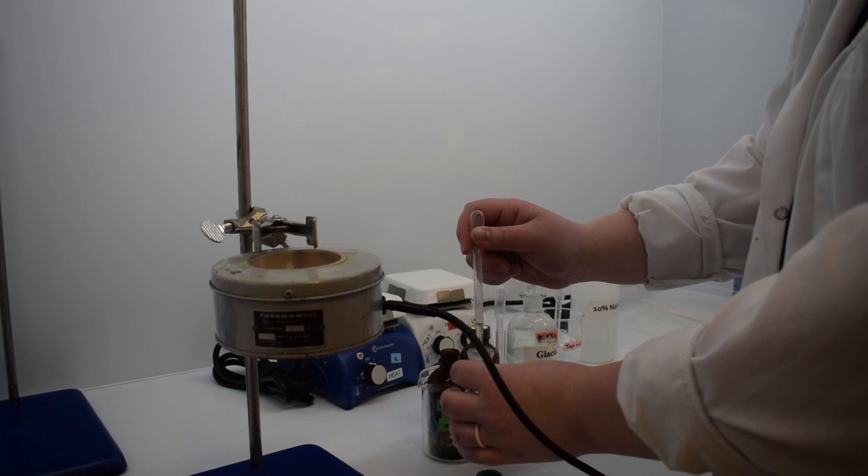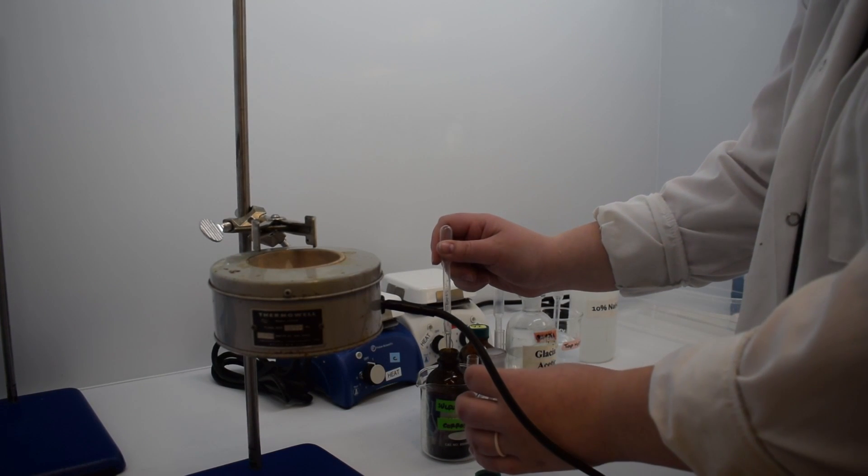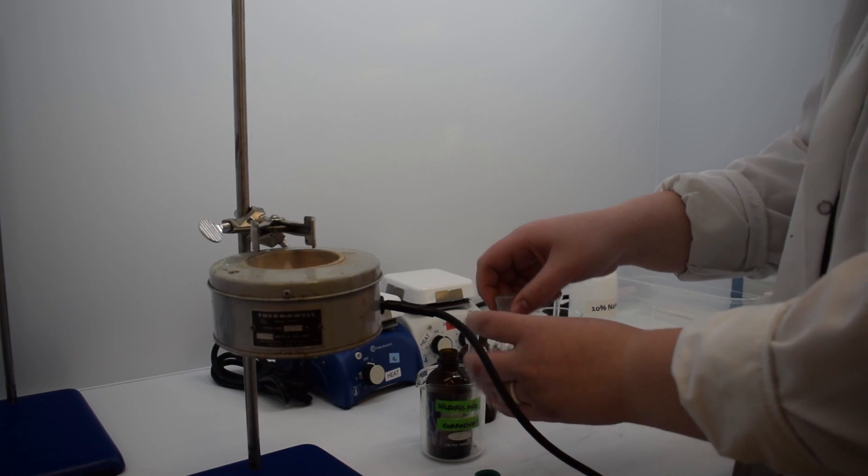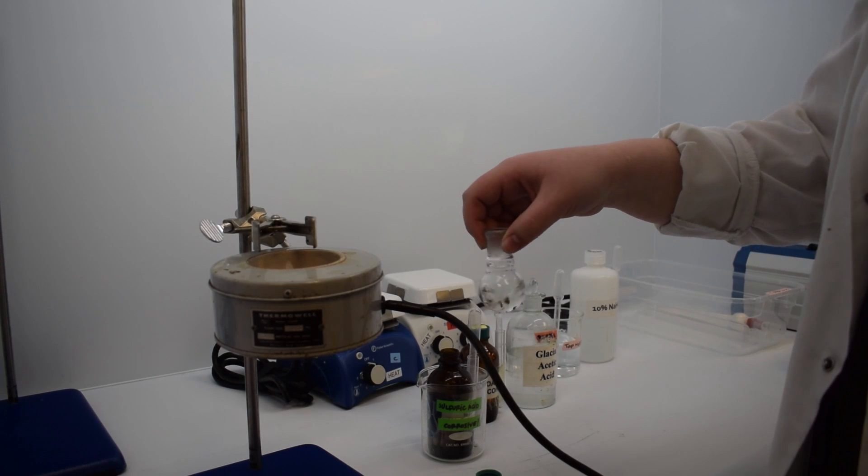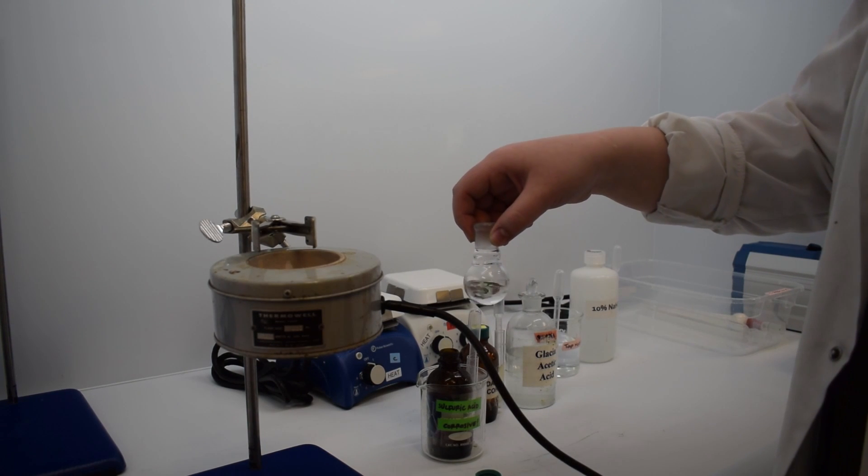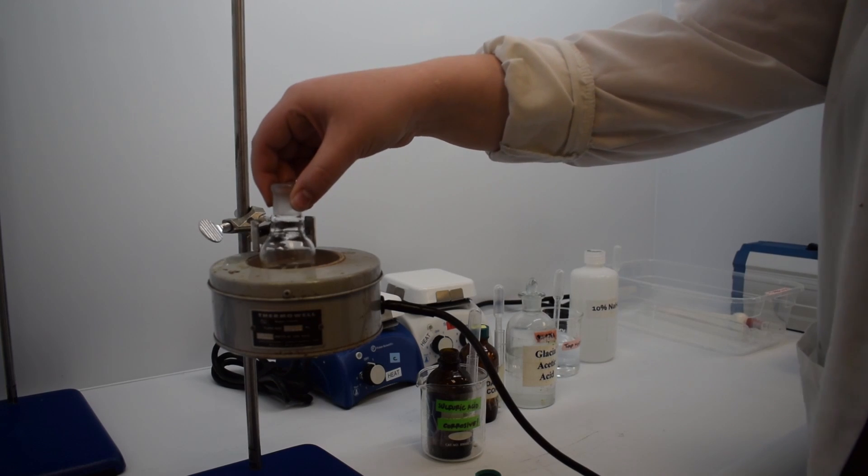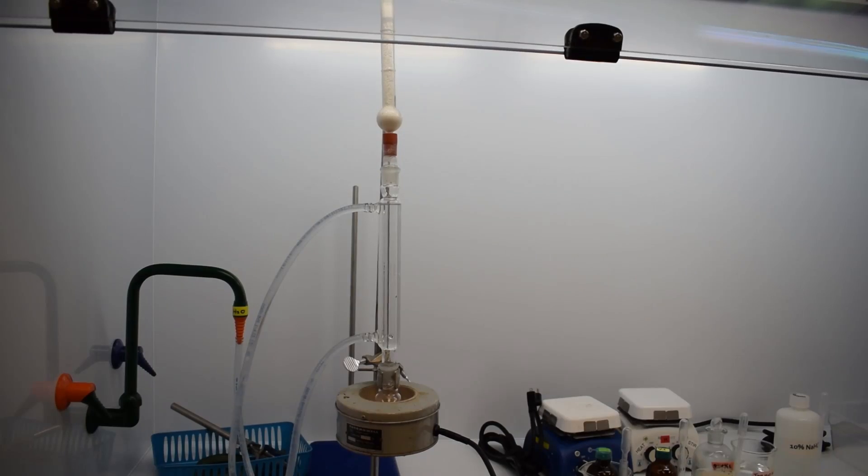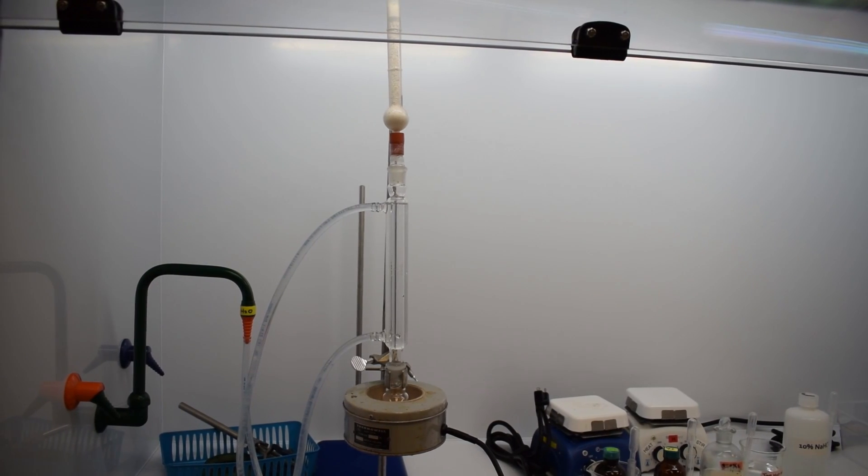Following the addition of all our reactants and catalyst, we'll give that flask a little swirl to mix it all together before clamping it to the ring stand in a heating mantle. We have now set up the reflux apparatus.